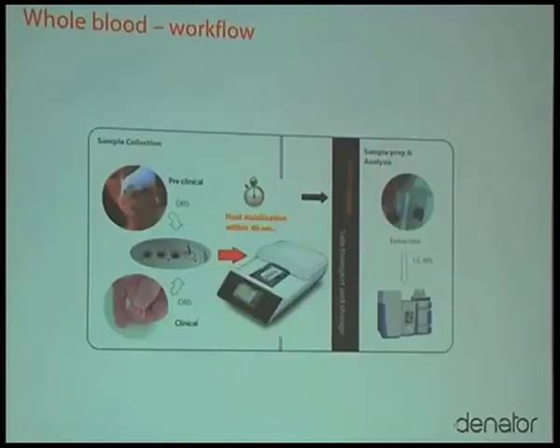However, the problem here is that from the moment that you put a drop of blood on the filter paper card until it's dry, depending on humidity, is roughly 1 to 2 hours. And during this time, you have a liquid sample at room temperature with enzymatic activity that can degrade your sample. So what we do is put the drops on there, put it in the instrument, heat and inactivate the enzymes, take it out, let it dry, and then you go downstream to analyze.